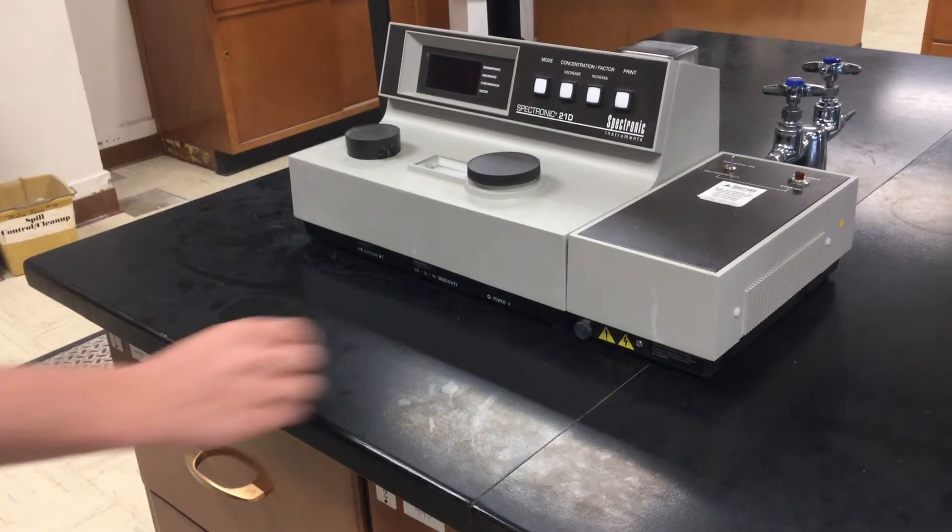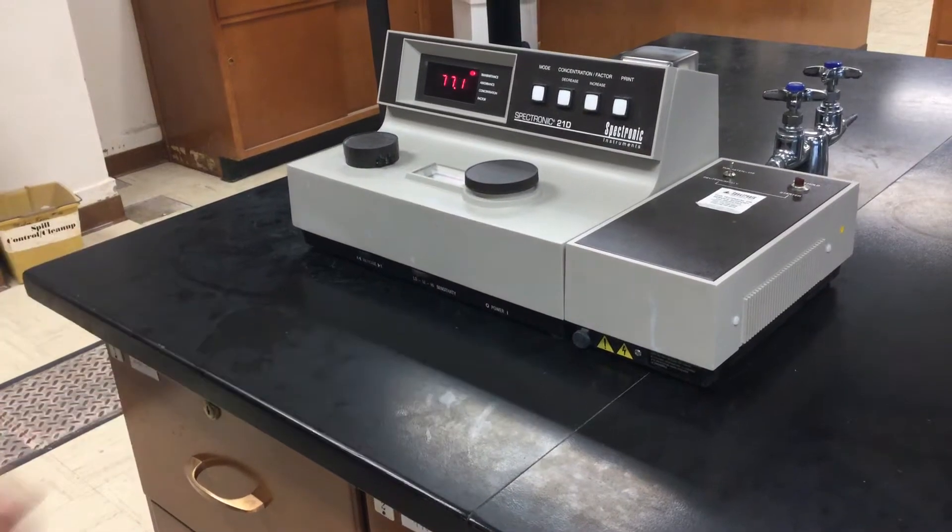Using a spectrophotometer. Turn on the spectrophotometer, or spec, and allow it to warm up for 10 minutes.